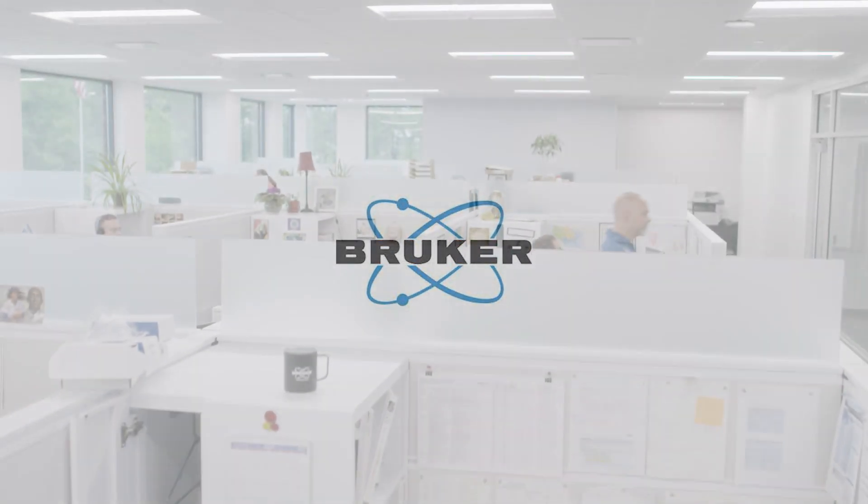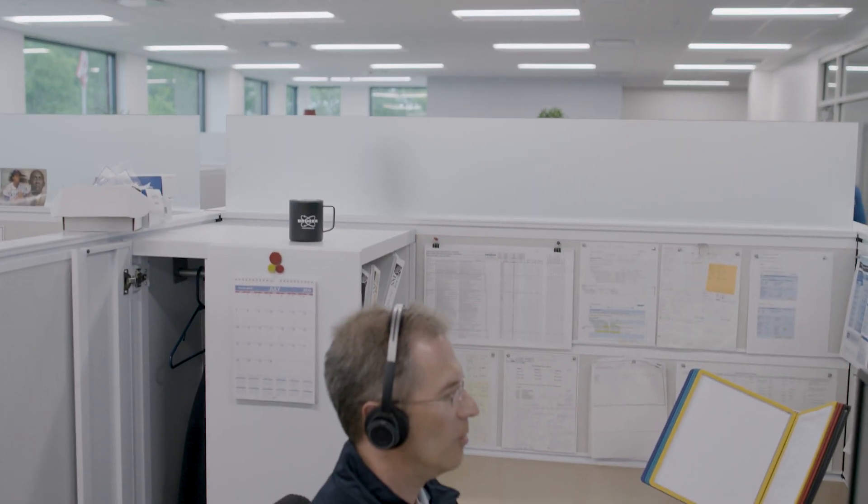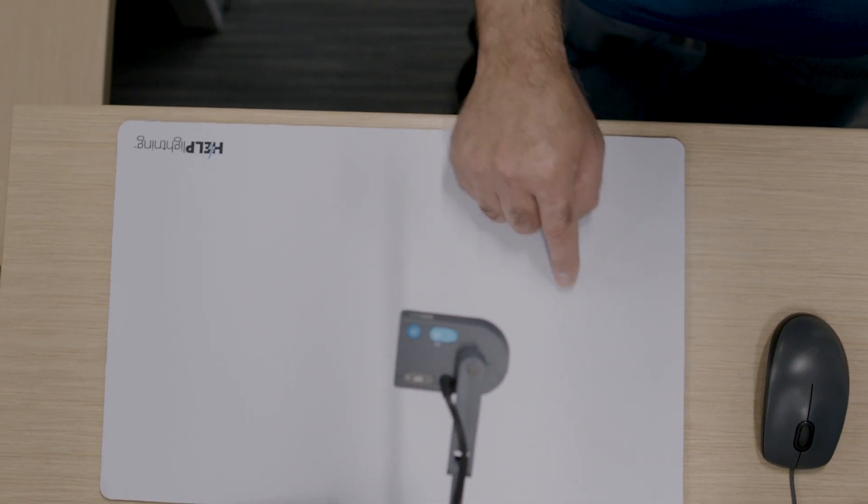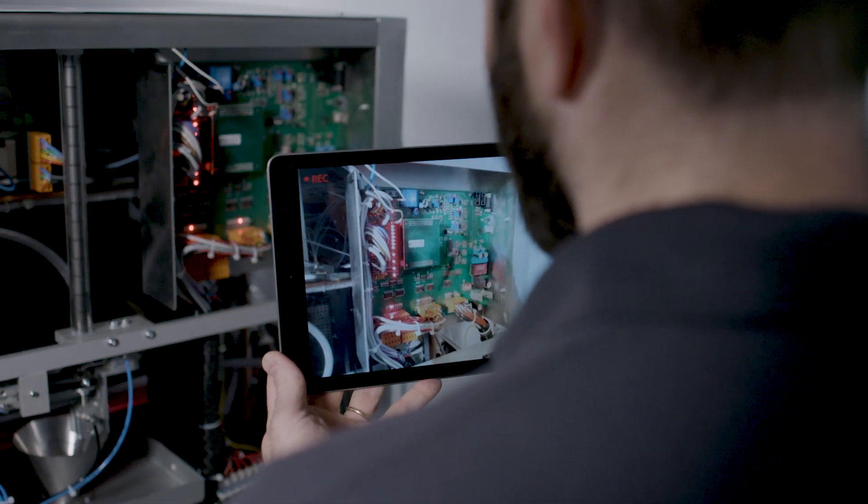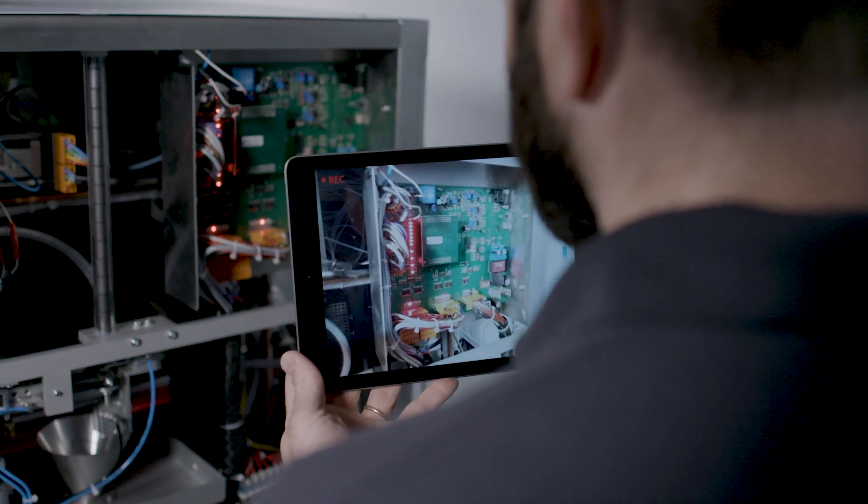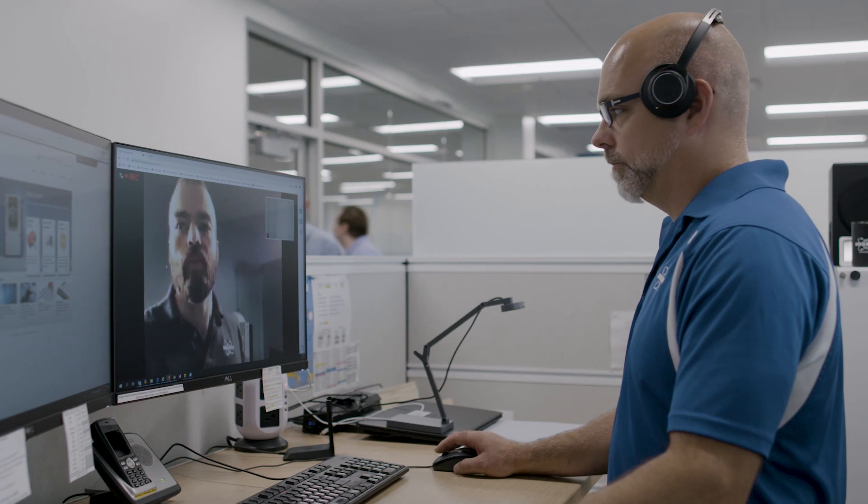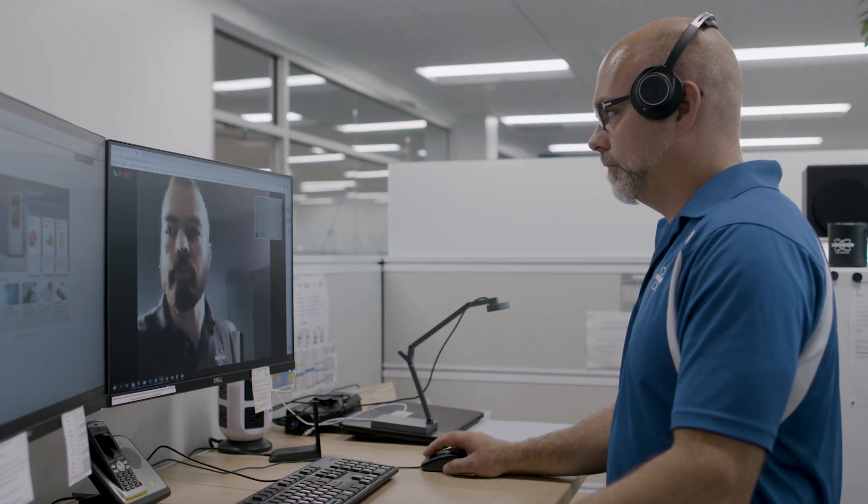Bruker's support desks are now equipped with the latest in augmented reality to assist you in troubleshooting your lab's equipment. Augmented reality simplifies instructions and enhances communication between our support desk and your team. Watch the following interaction between a lab engineer and a Bruker support professional.